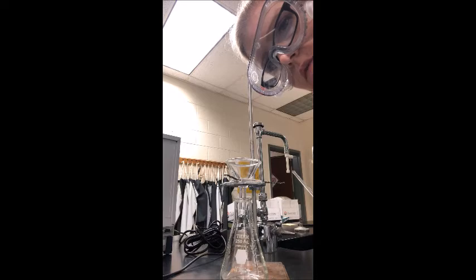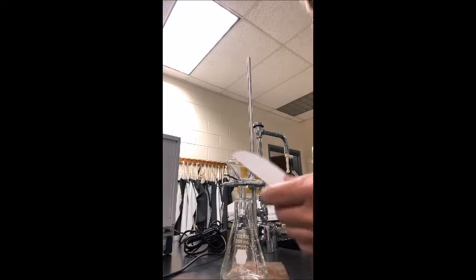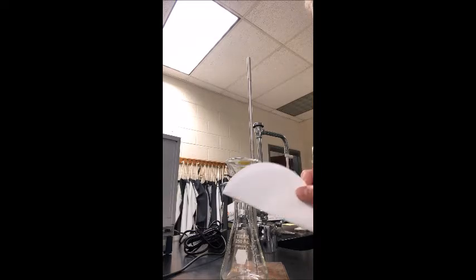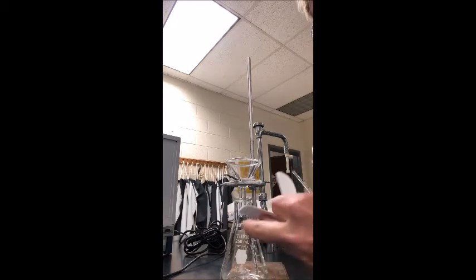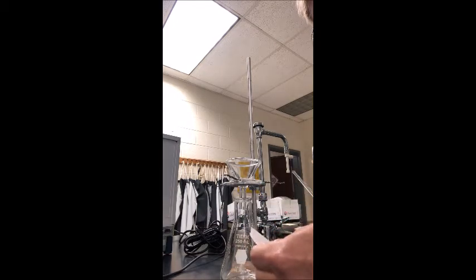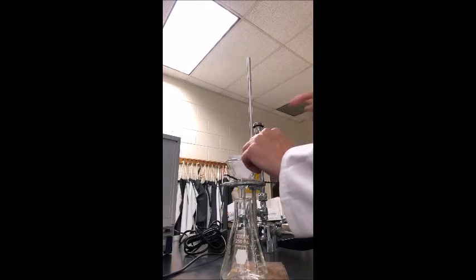Okay, so here's our setup for the filtration. We have our funnel, our clay triangle, the iron ring, the ring stand holding up the 250 milliliter Erlenmeyer flask here. Now I'm going to take the paper that I just measured the mass of for A, and you need to fold it in half. Then you fold it into quarters, and then after you've done that, you can pull 3 of them to one side, and it ends up looking like a cone shape that will fit into the funnel. Now, in order to get it to stick to the funnel, I'm going to just put a little bit of water in here so that it stays nicely.